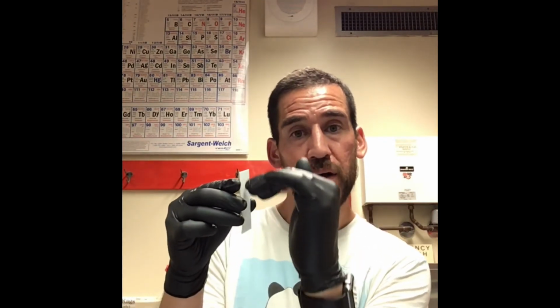There's tons of different types of chromatography, but what we're doing this week is thin layer chromatography. That's what that looks like. See this? It's got a piece of glass on one side and then a thin coating of silica on this side, and that would be our stationary phase because it's not moving. We're going to use something called an eluent that's going to travel up this, and that's going to be our mobile phase because it is moving.